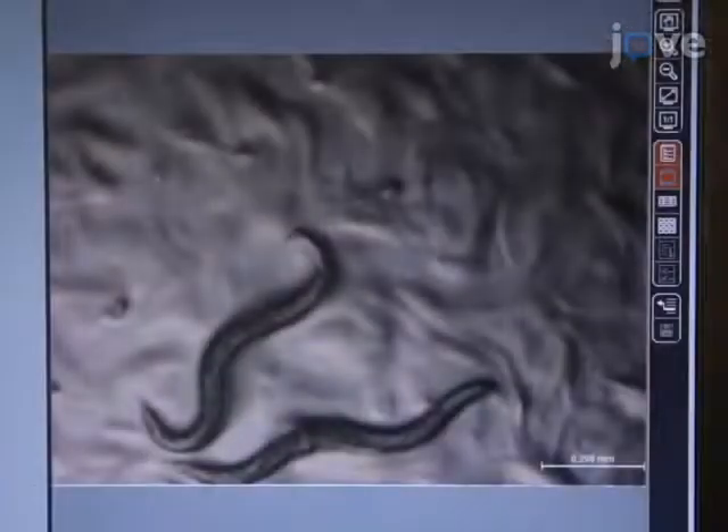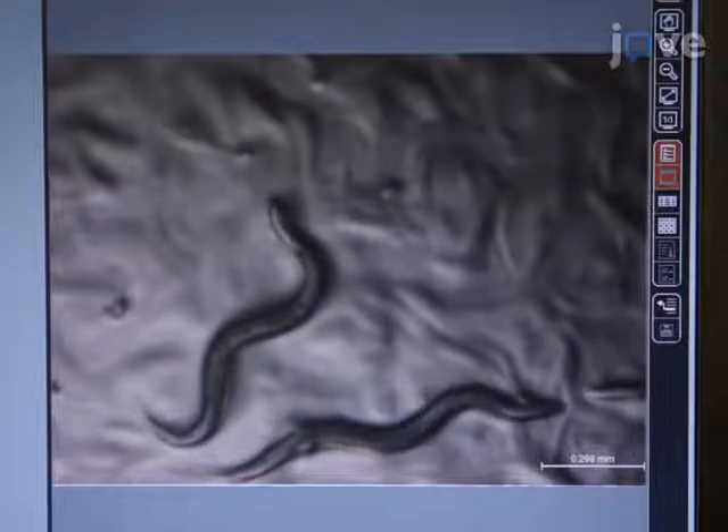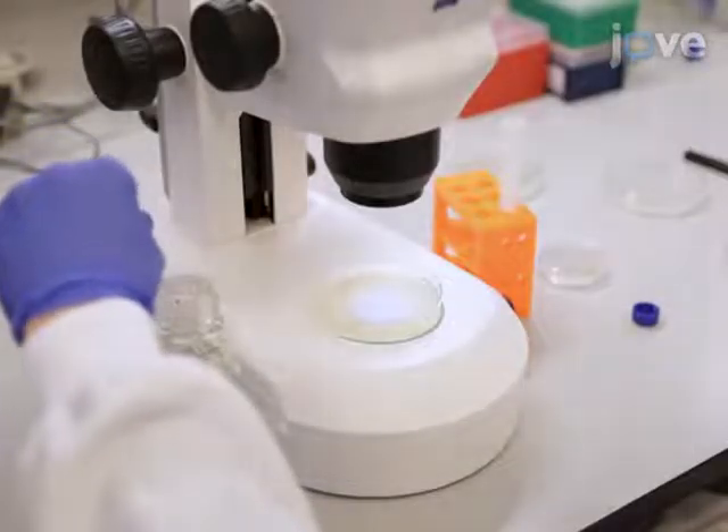On the 7th day, use a dissecting microscope to visually confirm the presence of eggs in the uterus. To collect the gravid adults, use a glass pipette to add 2 to 3 milliliters.